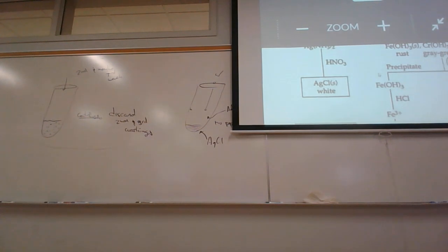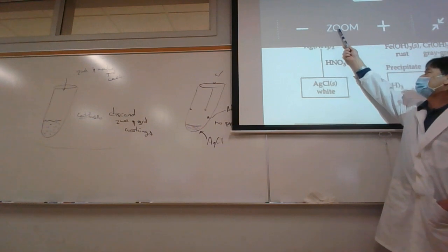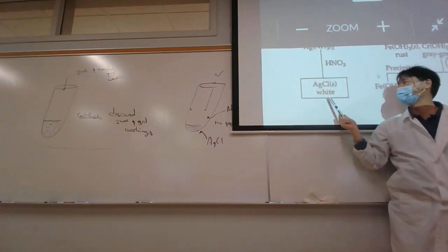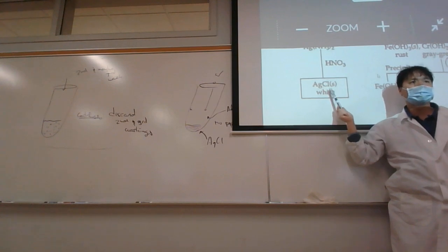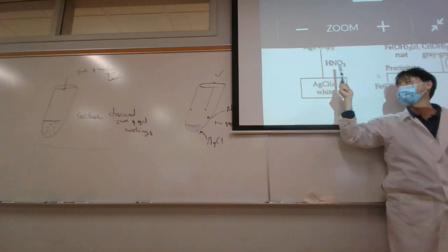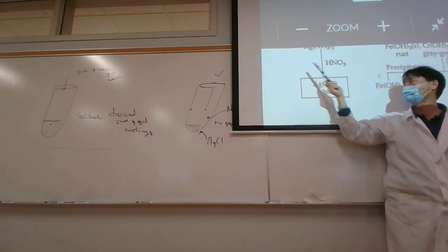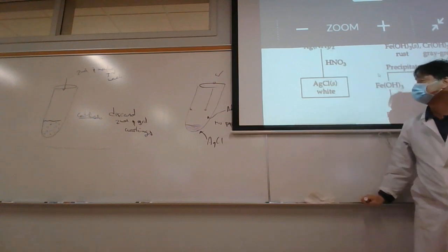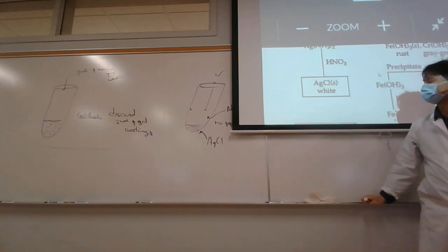So every semester, somebody's successful at getting white precipitate. They get the white precipitate to dissolve, but they're unsuccessful at getting it to reprecipitate. We need it to reprecipitate by reversing it. We reverse the reaction by adding nitric acid, which destroys the ammonia, which can reverse this previous reaction here. We'll go through the reactions later. What we're looking at is just the technique now.